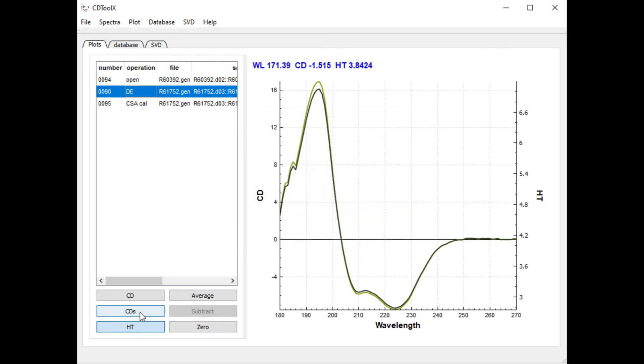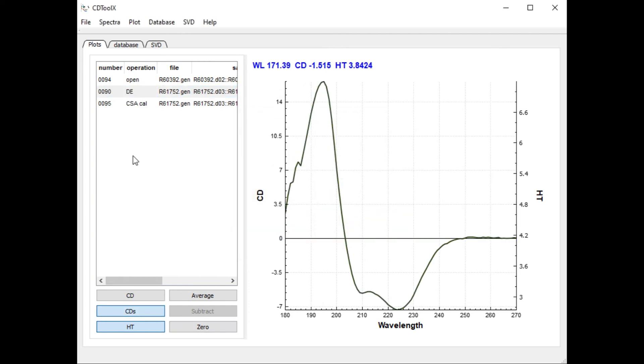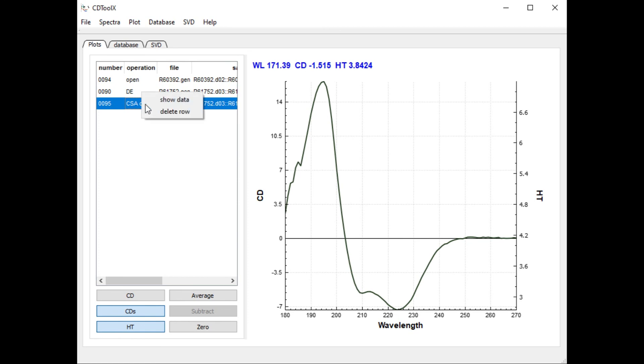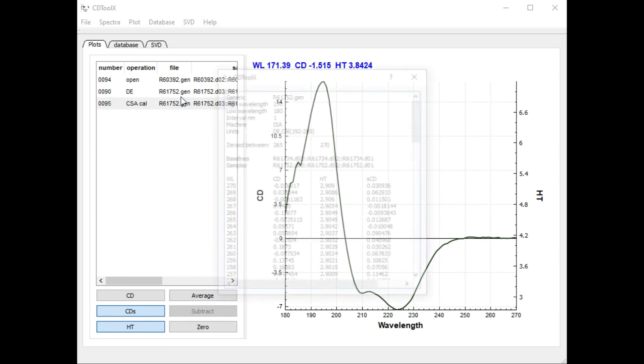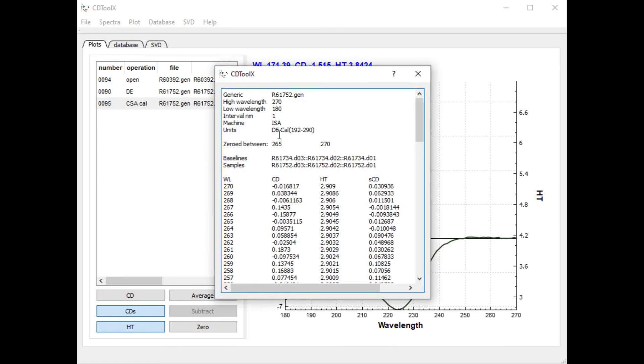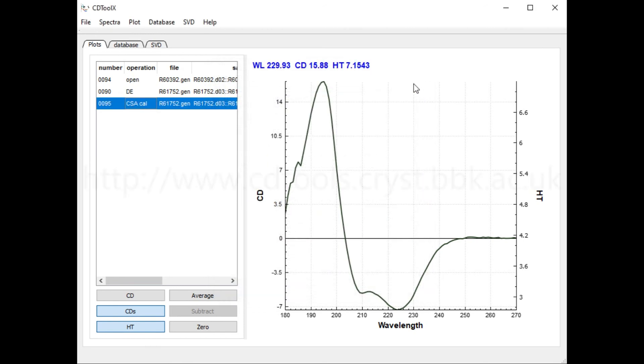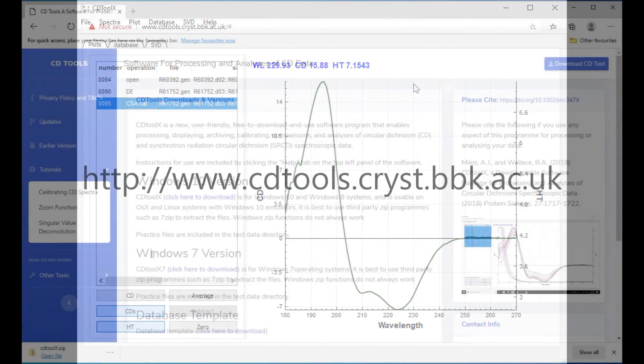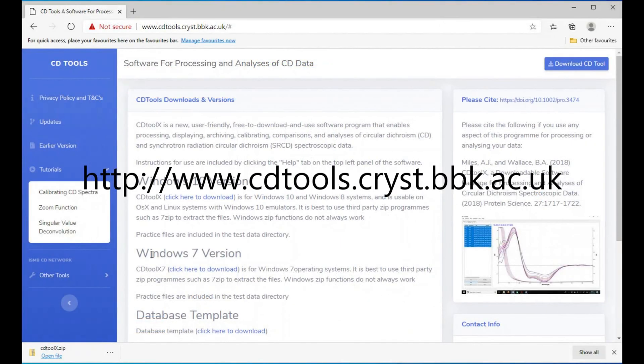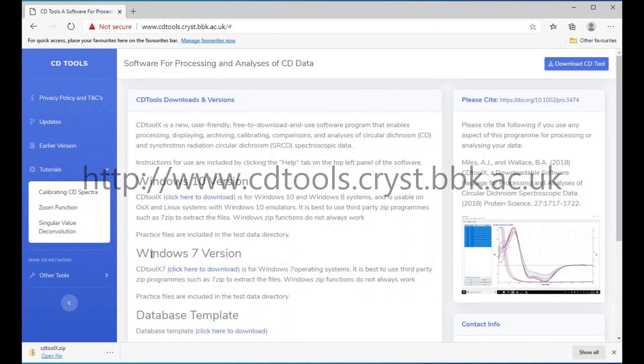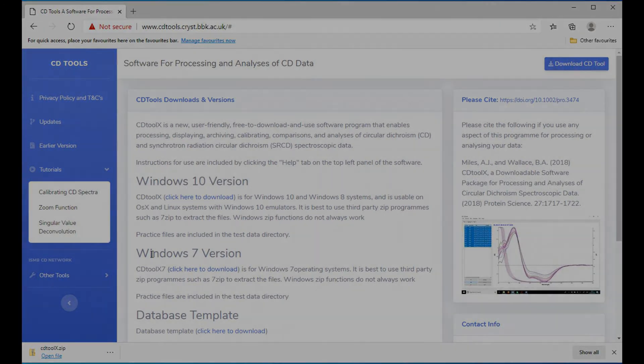If you right click the spectrum in the file list and choose show data you can view the data file. The units and the calibration points are recorded in the header. All of these processes can be performed on multiple files.